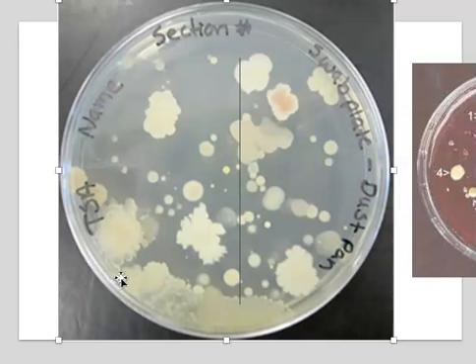The fungi can also grow on these plates. And while we think we could tell the difference between bacteria and fungi, we really can't. You really can't just by looking at the colonies. You need to take a sample from the colony, make a smear, stain it, and examine it under the microscope.